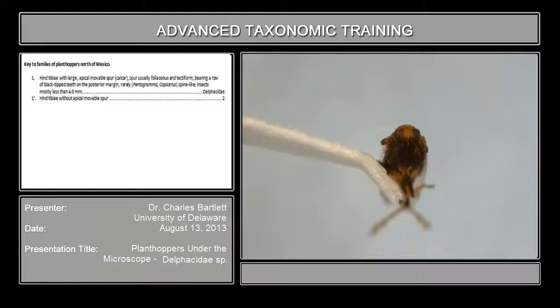I'm Charles Bartlett from the University of Delaware. Keys to Family — of planthoppers north of Mexico — reads: hind tibiae with large apical movable spur.